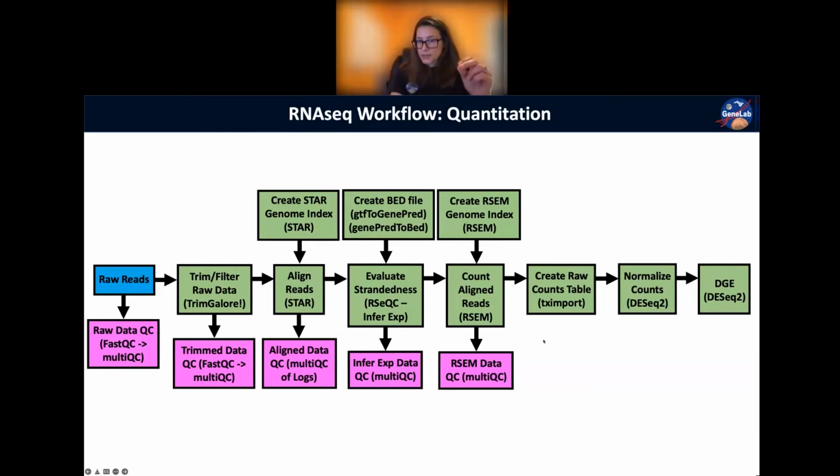Takes a lot to get your head wrapped around strandedness. Any questions about that before we do it in the Jupyter notebooks? You guys feeling good about that?